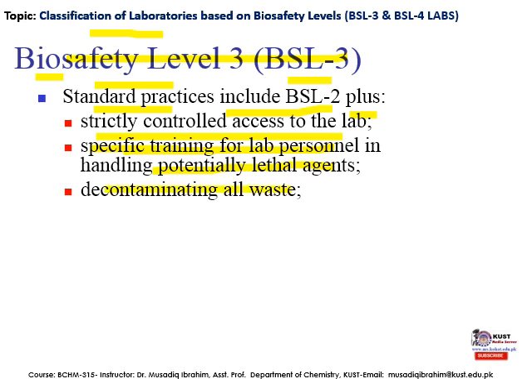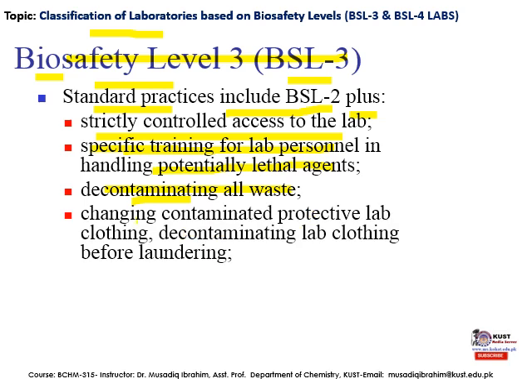Decontaminating all waste. So when a researcher is working in the lab, after completing his or her work, the waste should first be decontaminated and then put in the required container. Changing contaminated protective lab clothing and decontaminating lab clothing before laundering. It means that when you have completed your experiments and you are leaving the lab, you need to change those lab clothes, and you need to decontaminate them before they are sent for laundering.